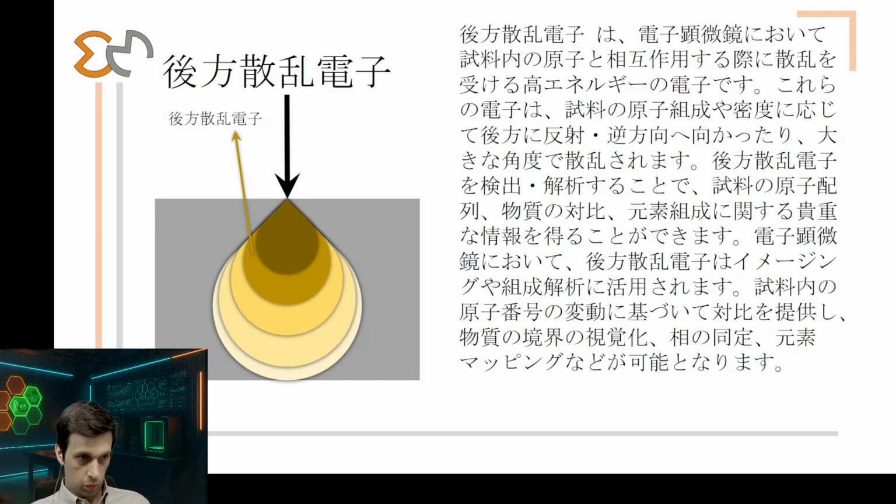In secondary electrons, we want to see the topography of the samples, like we are making a map with the mountains and the hills and the lakes, etc. In backscattered electrons, we want to see the structure inside of the surface of the sample. So how the crystals are oriented and what materials the crystals are composed of.